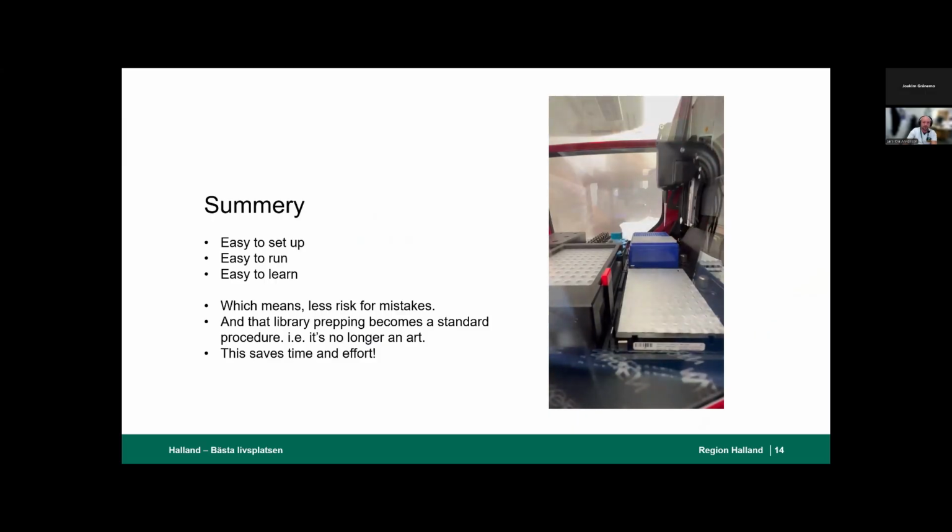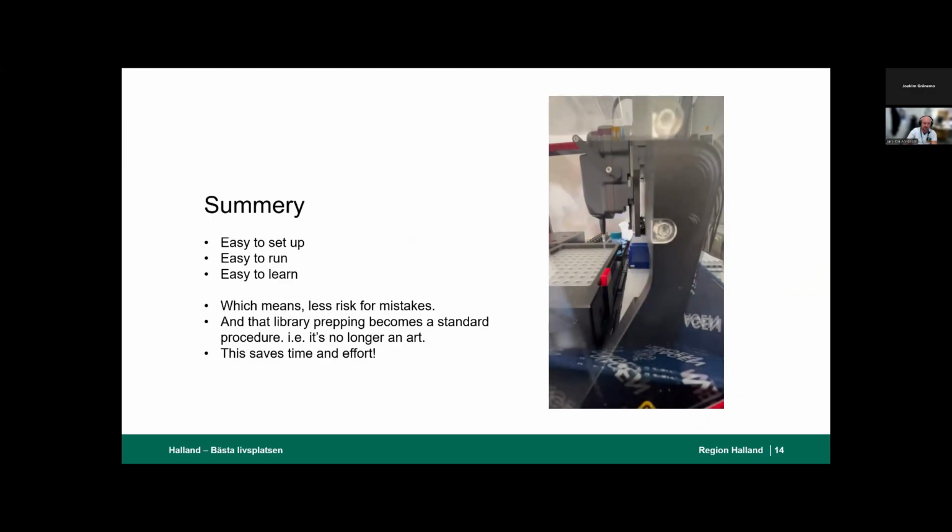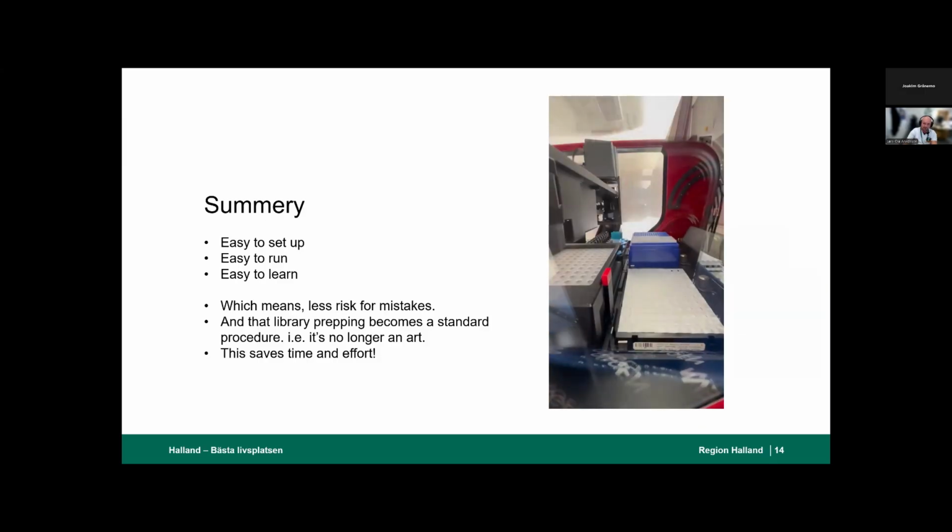It uses a tip to pierce the foil, then changes to another tip before transferring the liquid. So in case someone was thinking about this as a possible source of contamination, this is how that risk is limited.